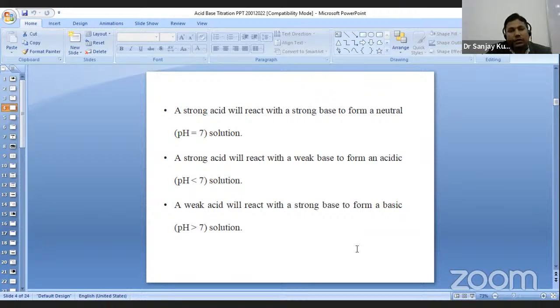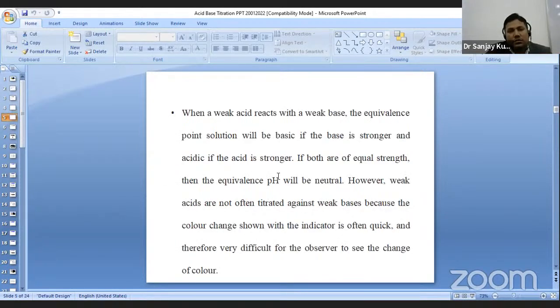That is the endpoint of a strong acid versus weak base titration. Similarly, for a weak acid and strong base, we reverse: pH 7 is neutral, but above 7 it gives a color. So these three are very important. The fourth, weak acid versus weak base, has no indicator available, because it is a rare reaction.